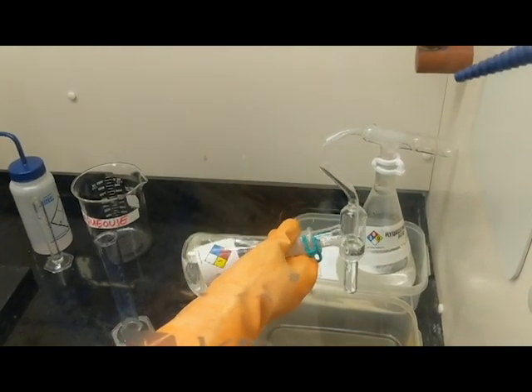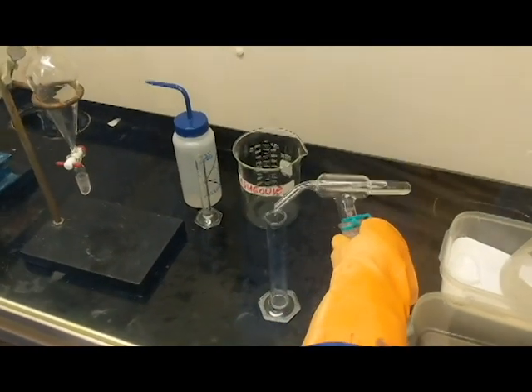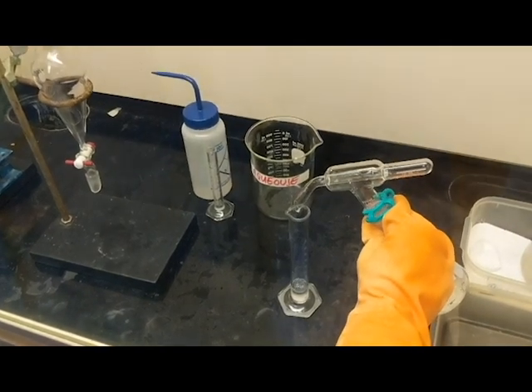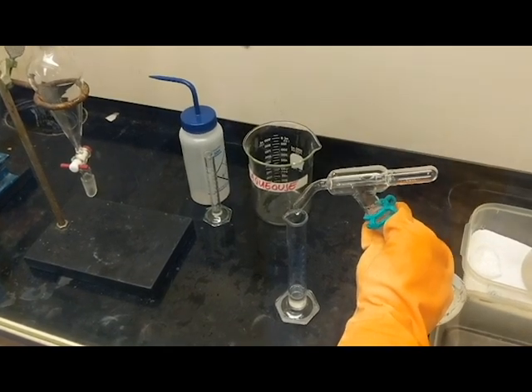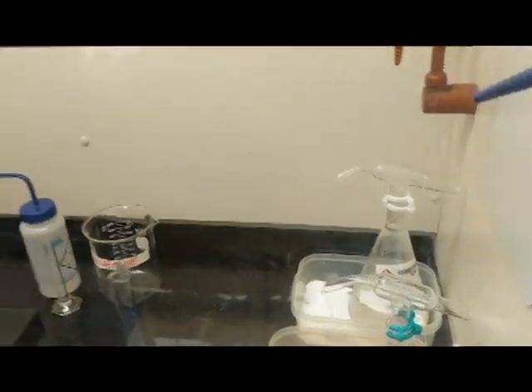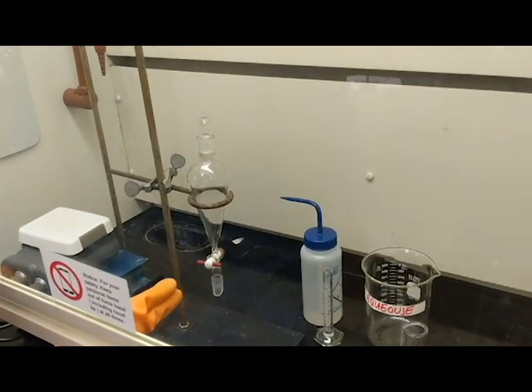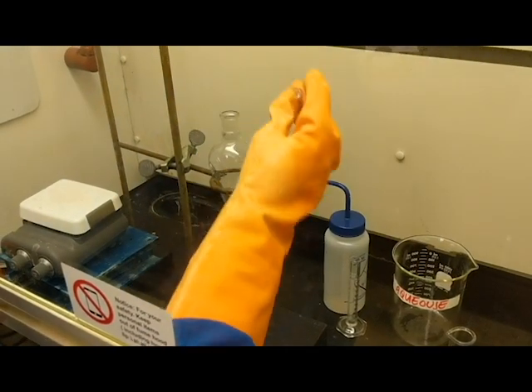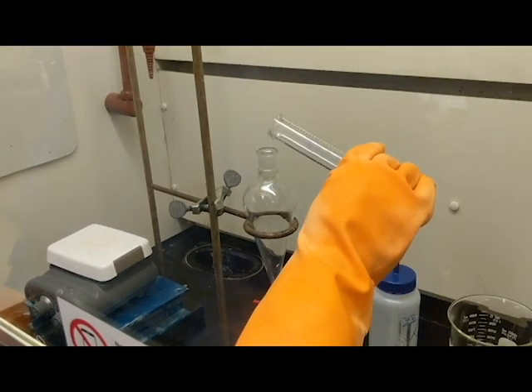I'm going to invert it, carry it over directly over my graduated cylinder with one hand, and slowly repipette my contents inside my graduated cylinder, allowing all of the drops to fall inside. Place that back in secondary containment. I'm going to make sure that my separatory funnel is in the stop position, noted here. I'm going to remove my stopper, and I'm going to slowly pour my contents inside.